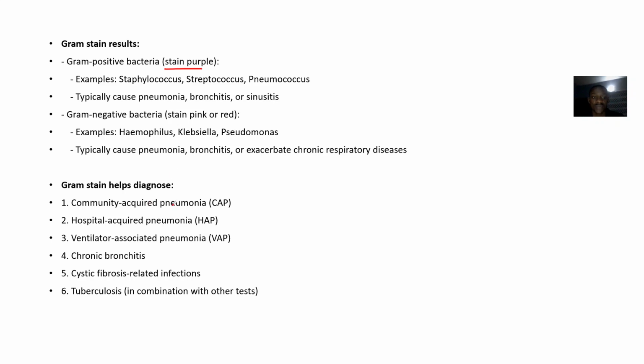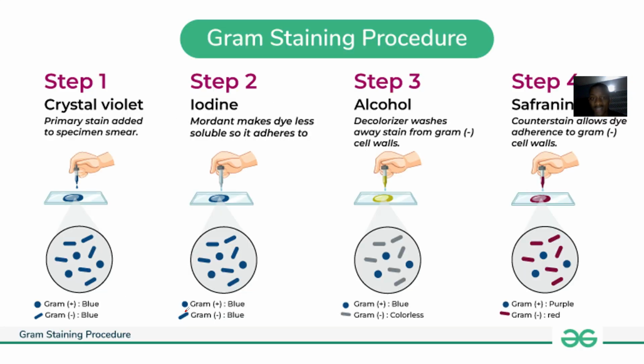Okay, so it helps us in diagnosing a lot of things like community acquired pneumonia, hospital acquired pneumonia, ventilator associated pneumonia, chronic bronchitis, cystic fibrosis, tuberculosis, and all of that.